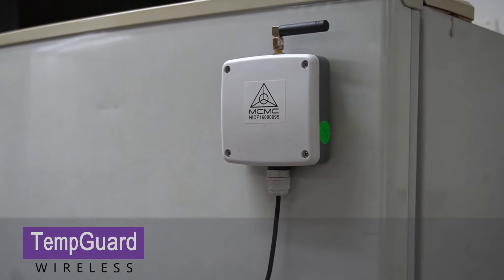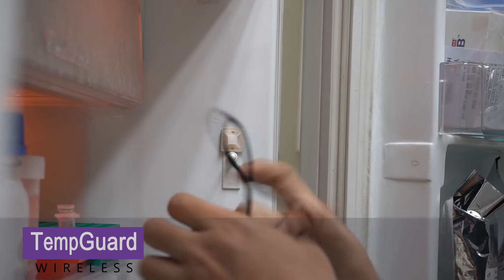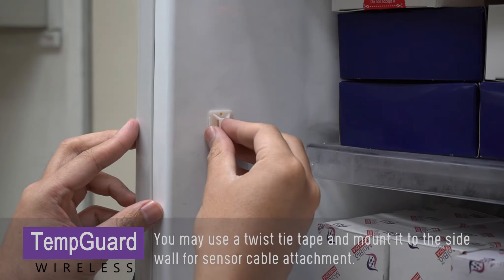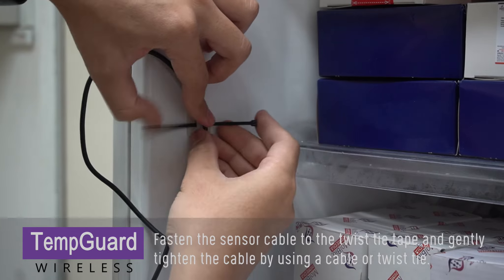Slide the sensor cable into your equipment through the door hinge. You may use a twist tie tape and mount it to the side wall for sensor cable attachment. Fasten the sensor cable to the twist tie tape and gently tighten the cable.